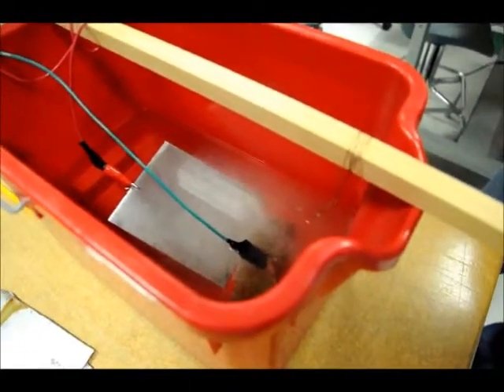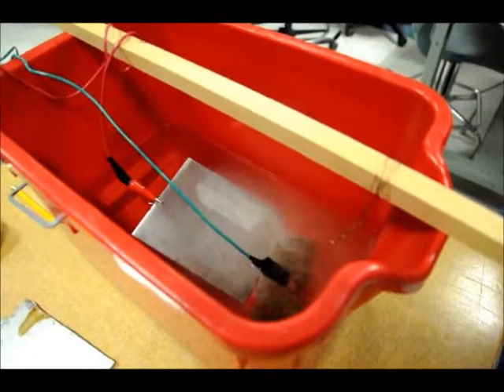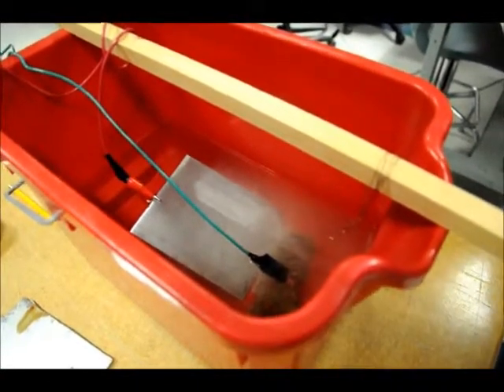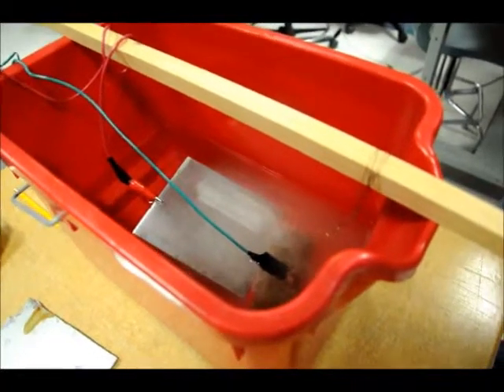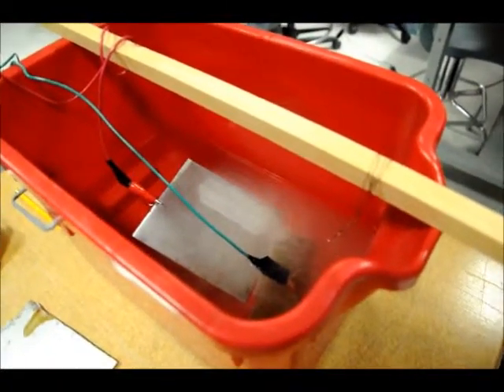What you don't want to do is keep your face over the top of the tank, because hydrogen gas is coming up. And also, what I learned today through some research is that chromium gas is being produced as well — chromium oxide.